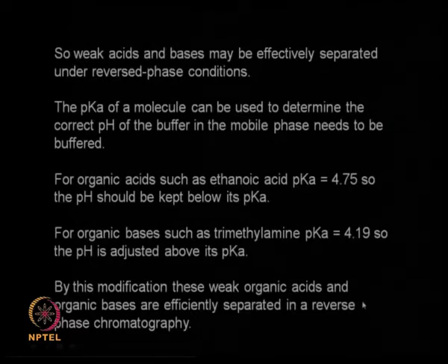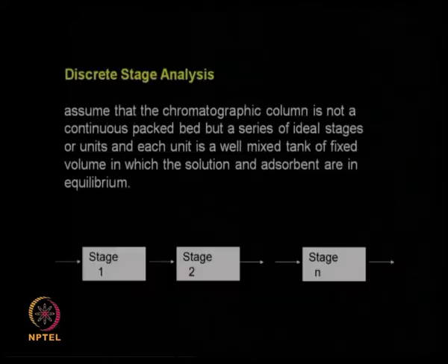Otherwise if we do not suppress the ionization, these acids or these bases will get ionized, and the separation efficiency of these compounds is extremely poor in a reverse phase chromatographic system. So this is called ion suppression reverse phase chromatography.